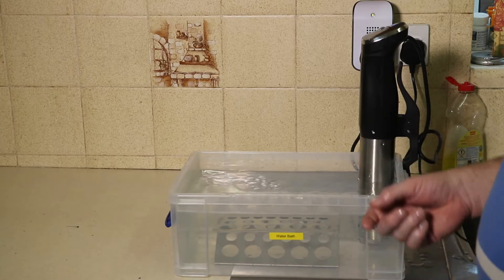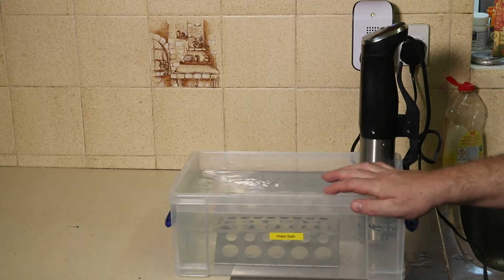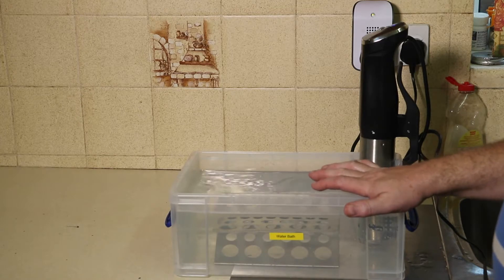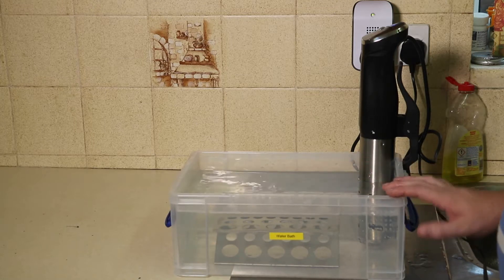The only drawback is if I want the water very hot — this will go up to 95°C — then this box isn't any good. But I do have a cheat: I've actually got a stock pot, and it works.